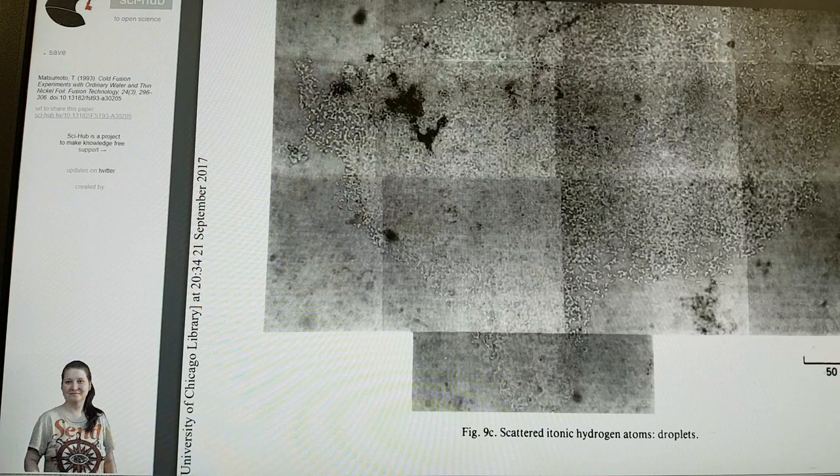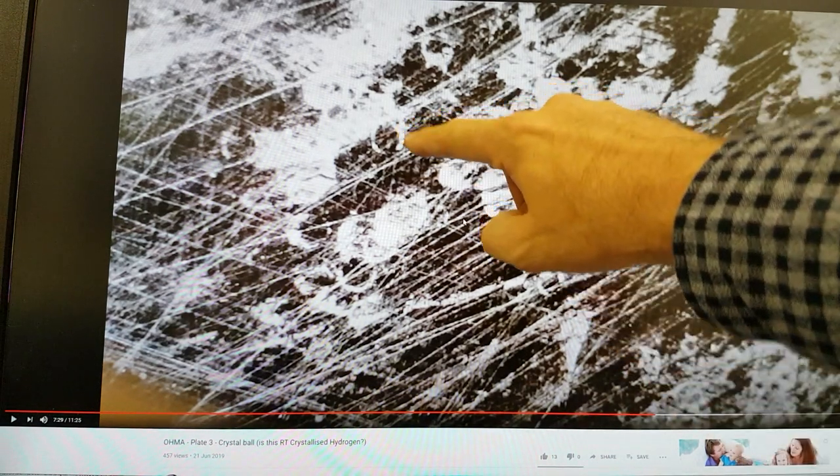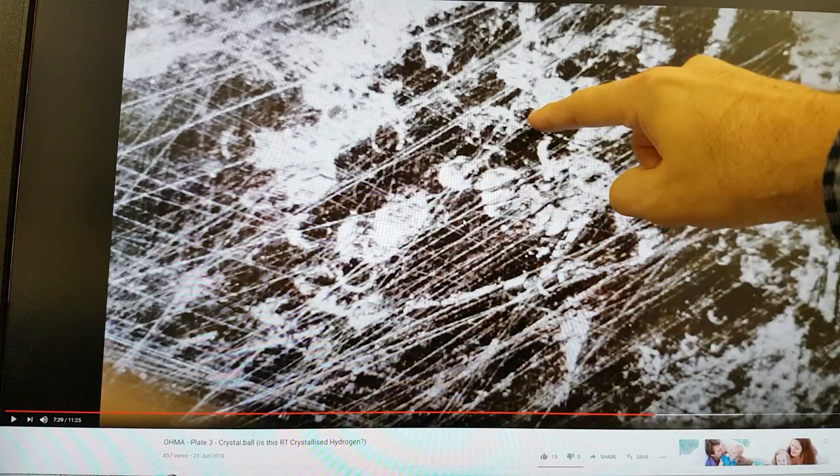There we go — you look at samples and you see this. When I was looking at the Amasa plates originally, I used the polarization filter and it made things that weren't there appear. This was on one of the vibrator plates and all over you saw these ring marks, all over.